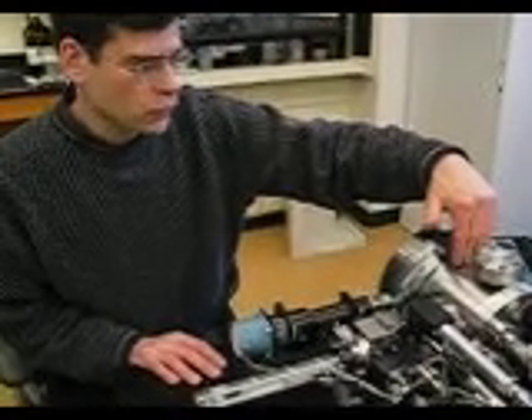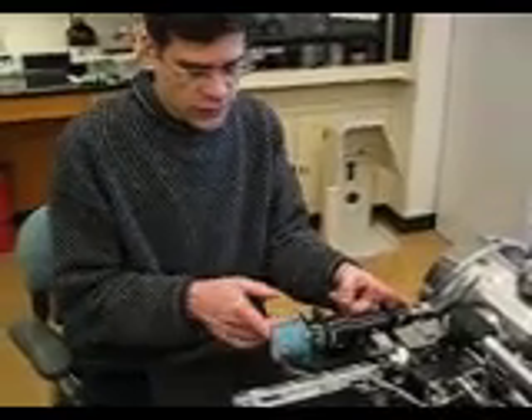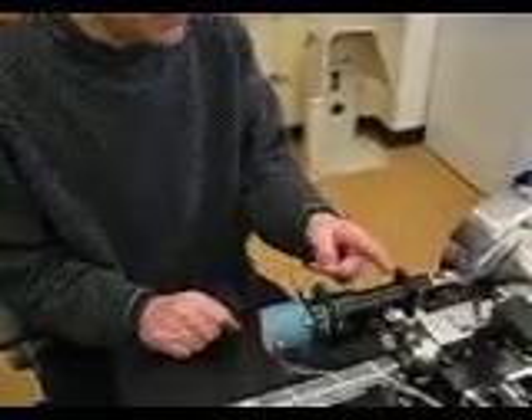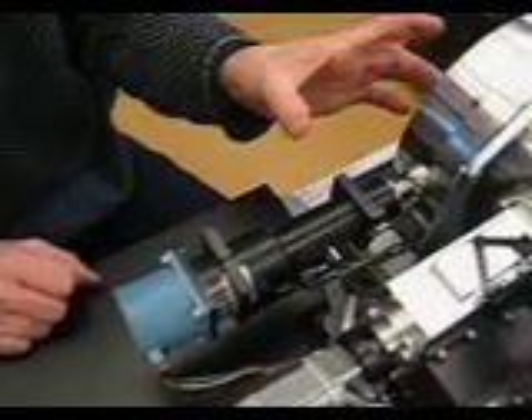Now that molle plate can be moved in two dimensions. One, the x-dimension, using this digital motor assembly, can shift the plate in and out in the x-dimension.